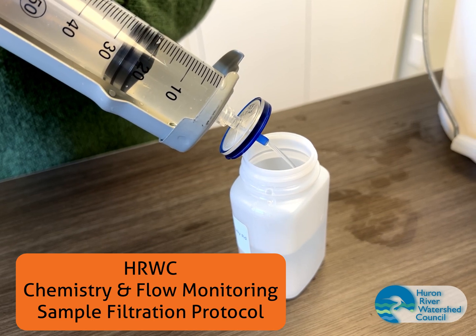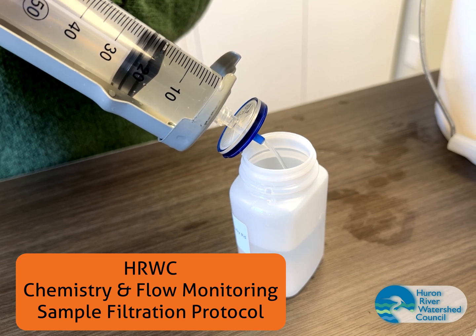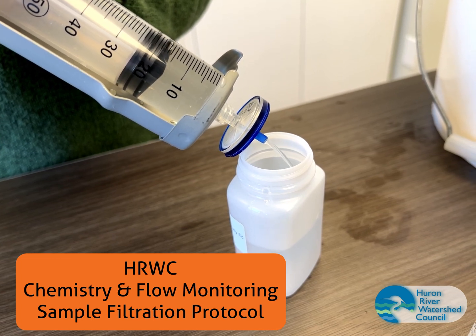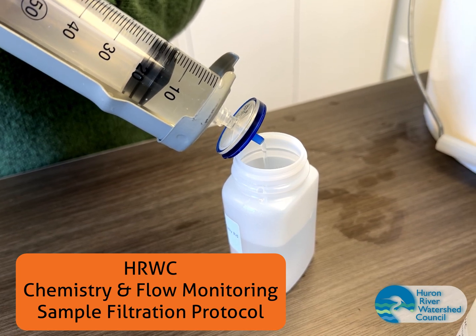This video provides instructions for filtering stream or river water for the Huron River Watershed Council's Chemistry and Flow Monitoring Program. Filtering a sample allows our laboratory partners to analyze chemicals dissolved in the water column.